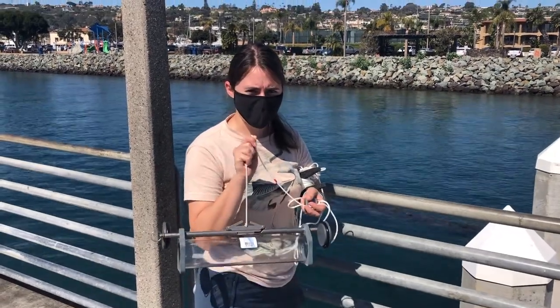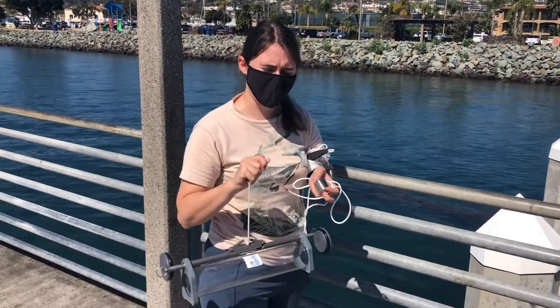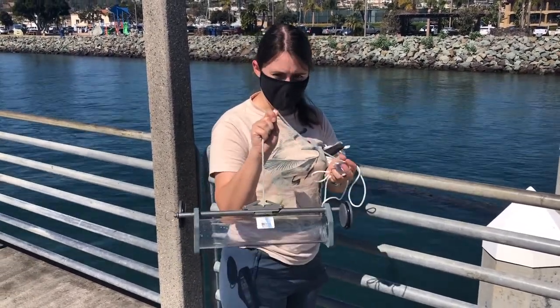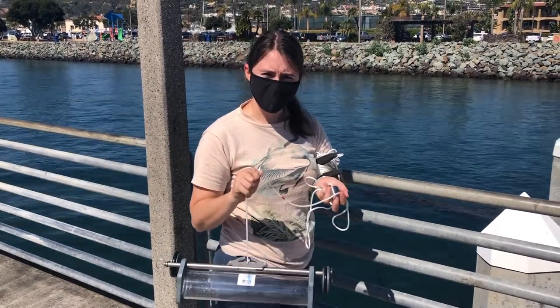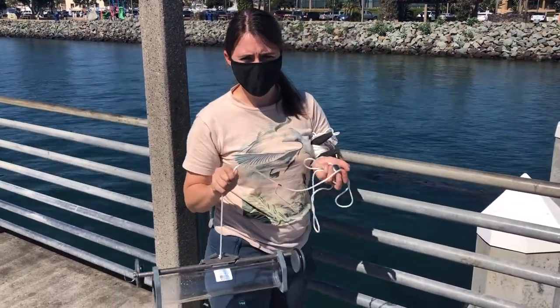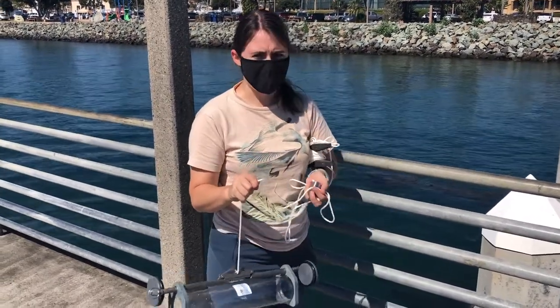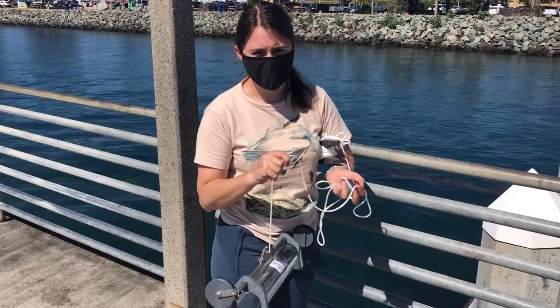Now I'm going to show you how to actually put the sampler in the water and collect the sample. Be sure to keep your messenger in your left hand, and you'll have your sampler in your right hand. You can do this with one person — it's a little easier with two, but I'll show you how to do it with one. Have all of your rope ready, and it's good to have the amount of rope you already need ready to go.